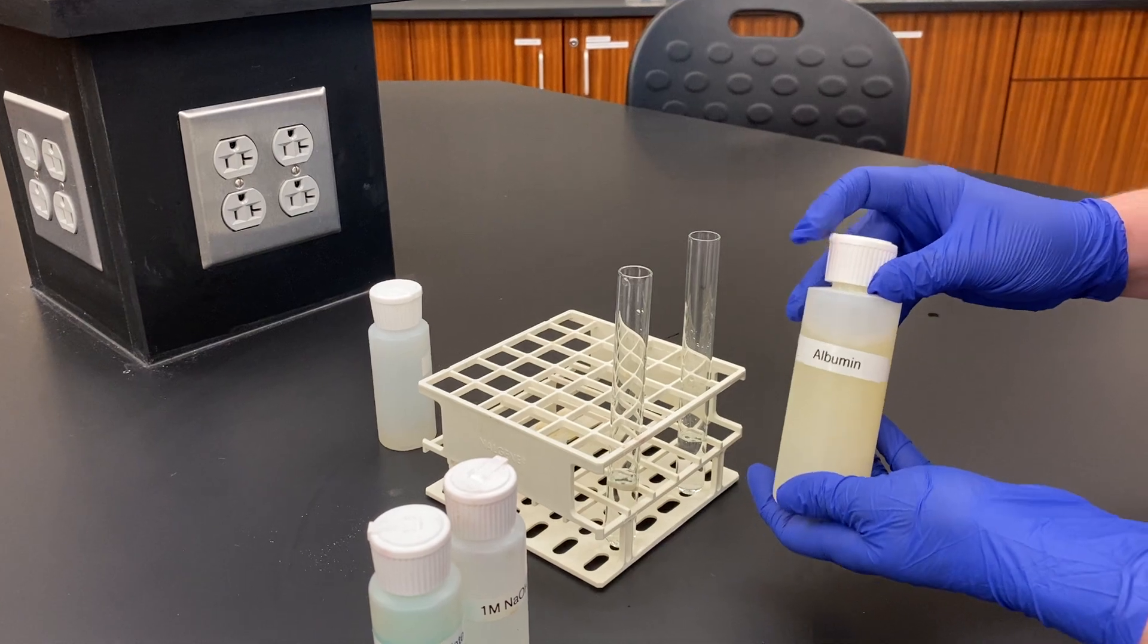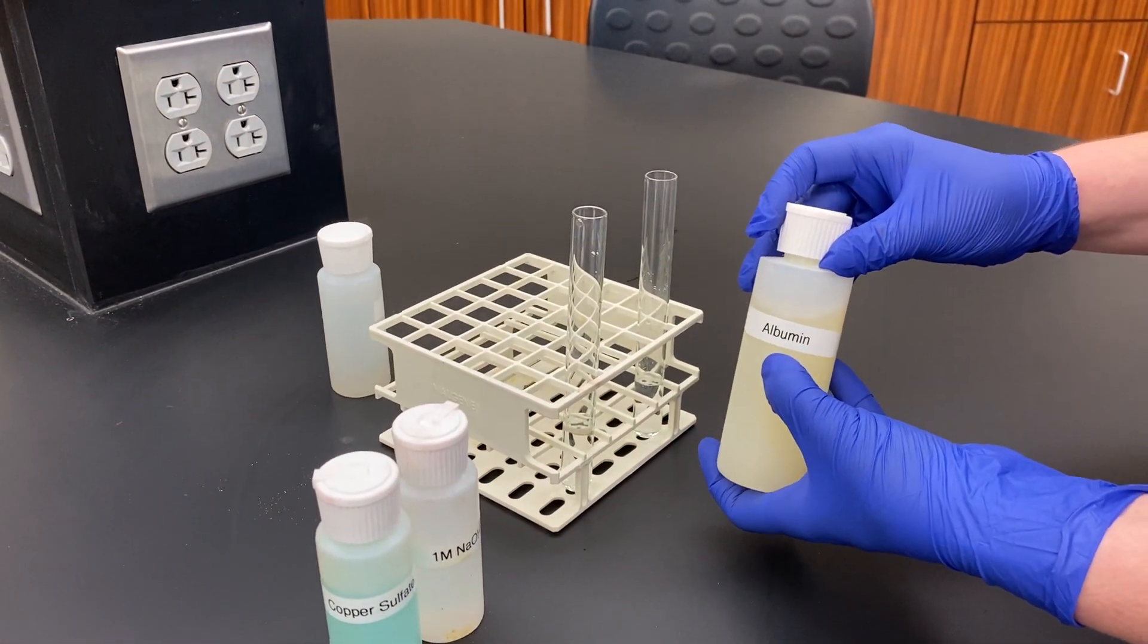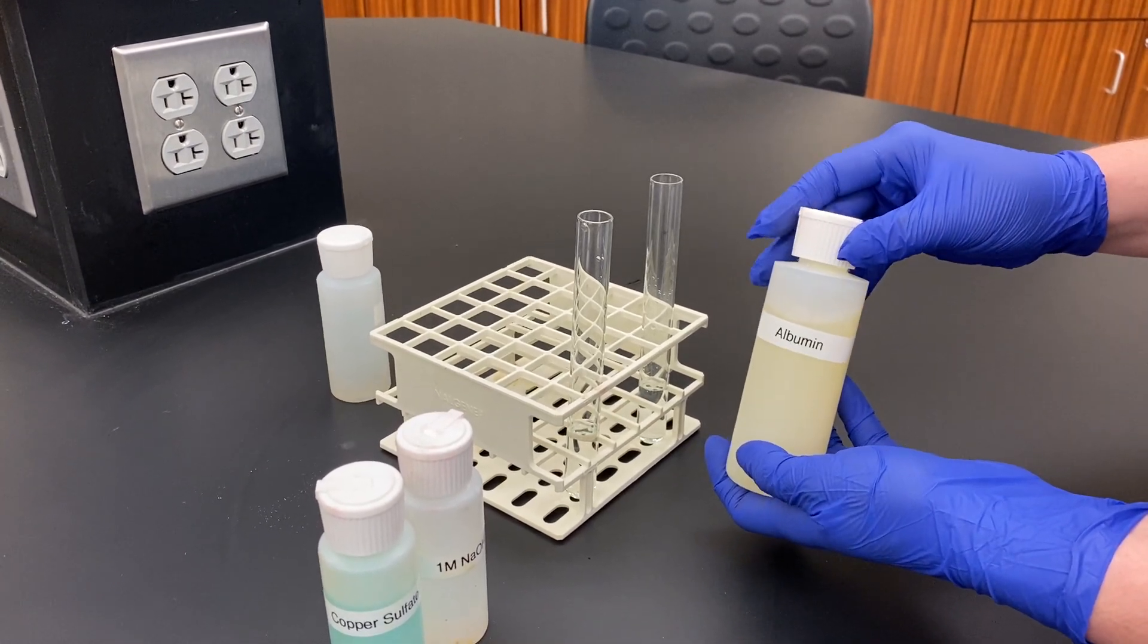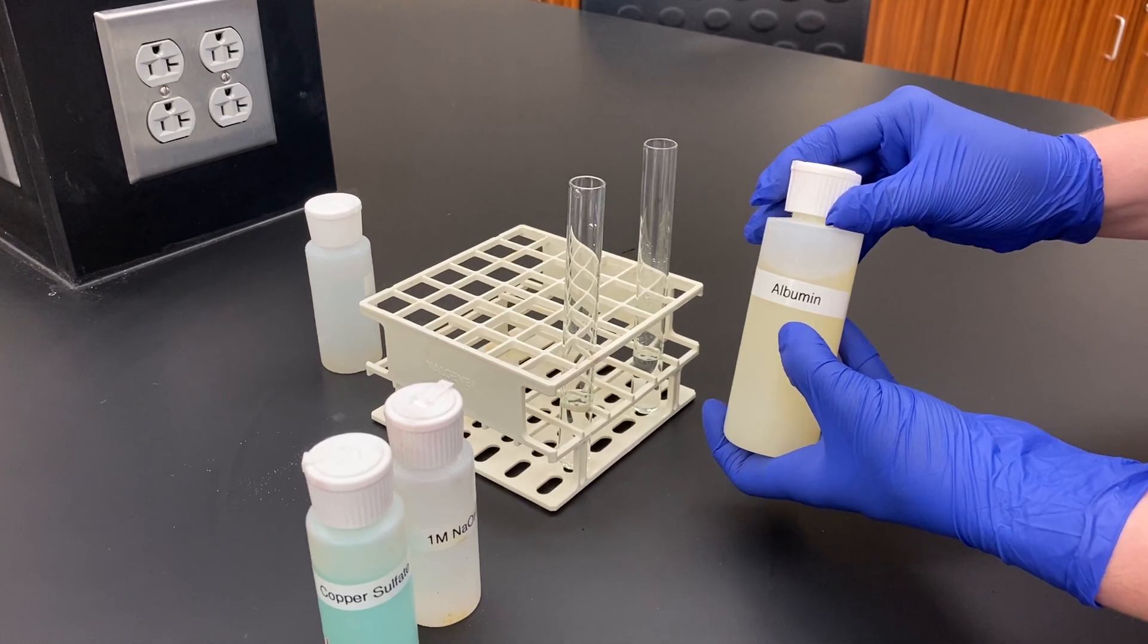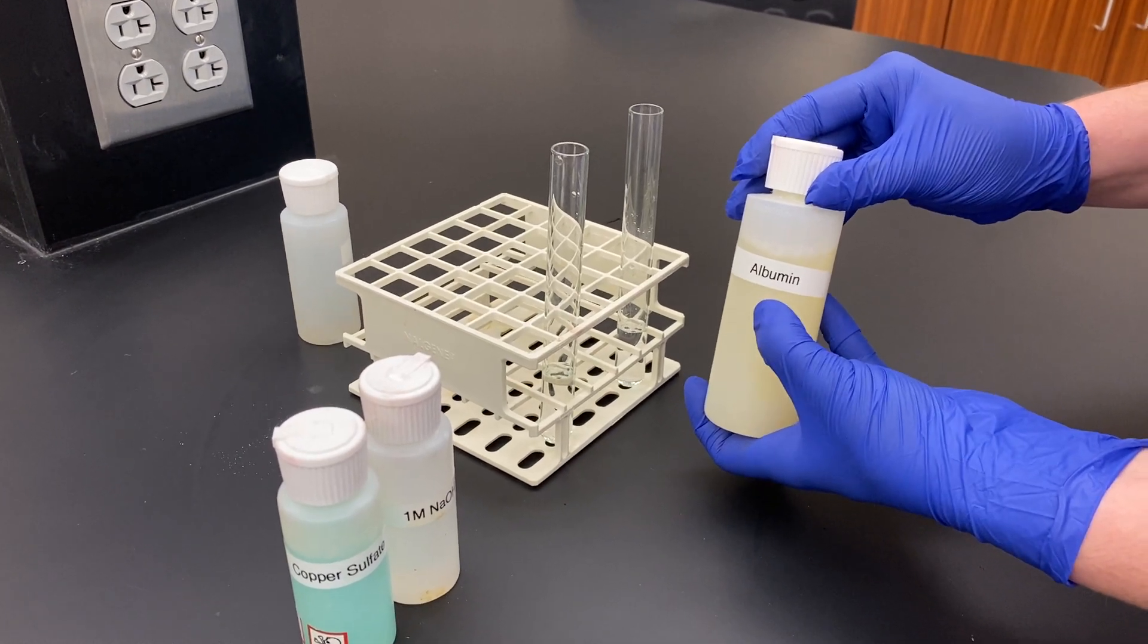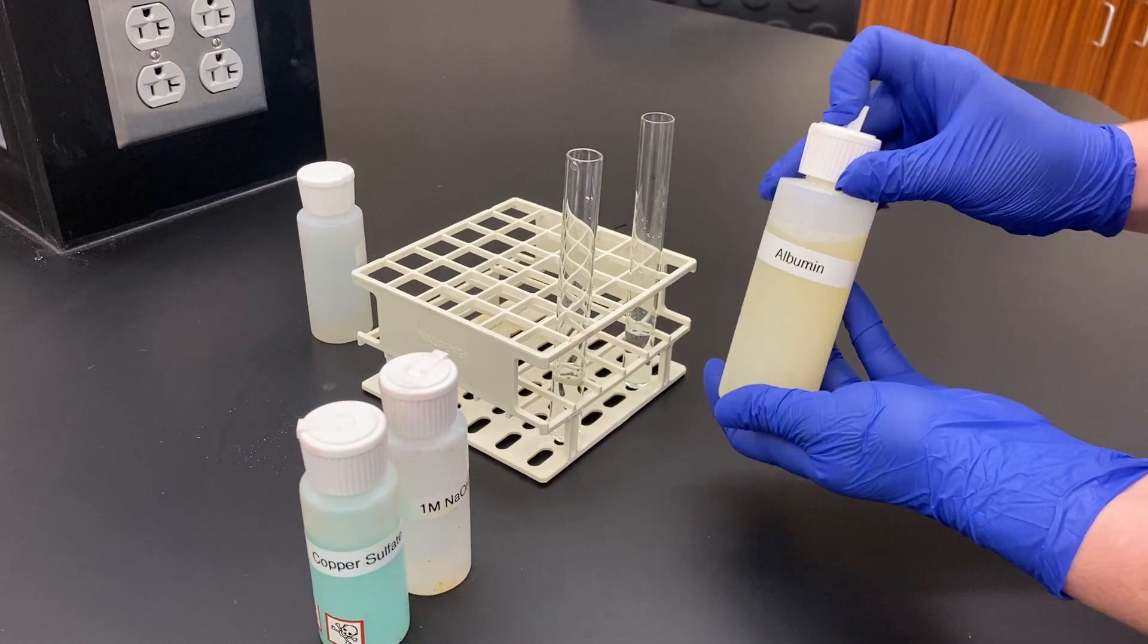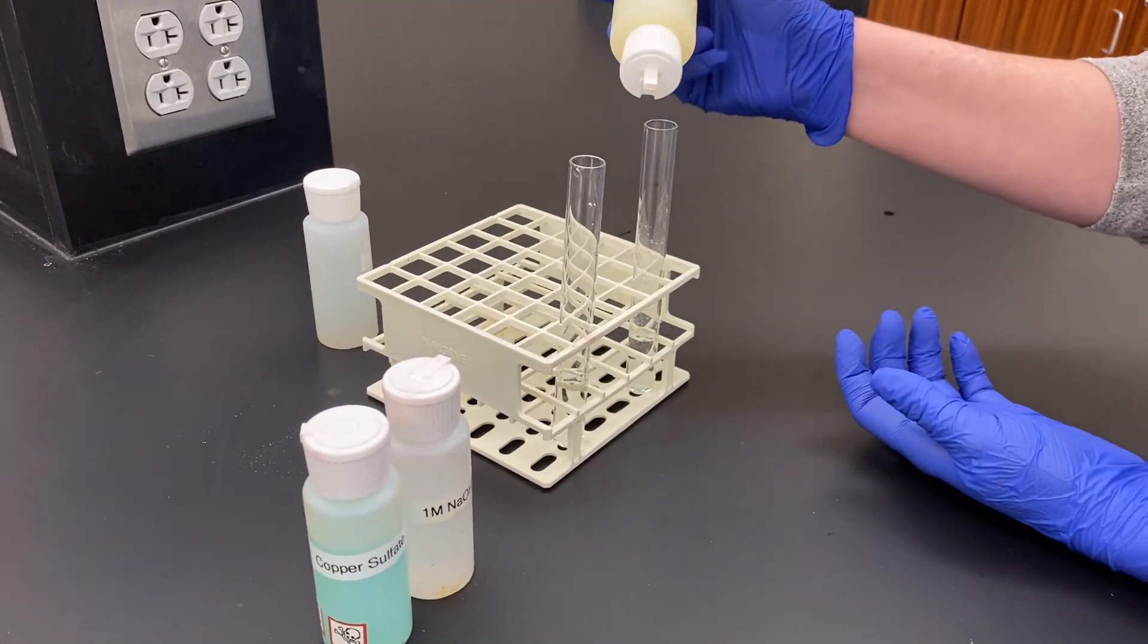And we are going to add albumin as our example protein. You might have talked about albumin before in the process of denaturation. Albumin is a protein that's commonly used in a lot of different organisms. You might have talked about the concept of how when you fry an egg, you permanently denature a protein within the egg white. What you're denaturing is the protein albumin. We're going to add 10 drops of albumin.